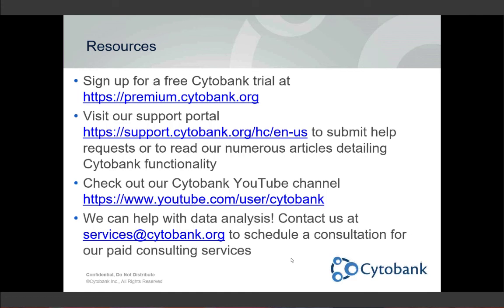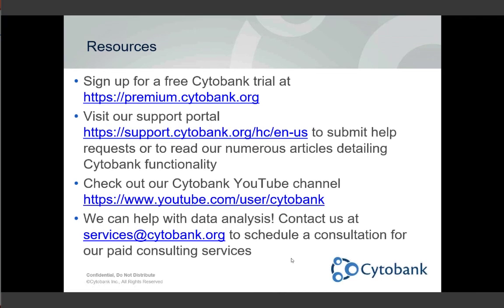Mm-hmm. Yeah, that's kind of what we talked about in the intro. You generate a lot of data, and with that you get a lot of information, but it means there's a lot of rabbit holes you can go down. Definitely, and using platforms like Cytobank cuts down the amount of work on the biologist's part, on my part, to kind of wade through all of that data. It really helps me simplify and work through it much faster.